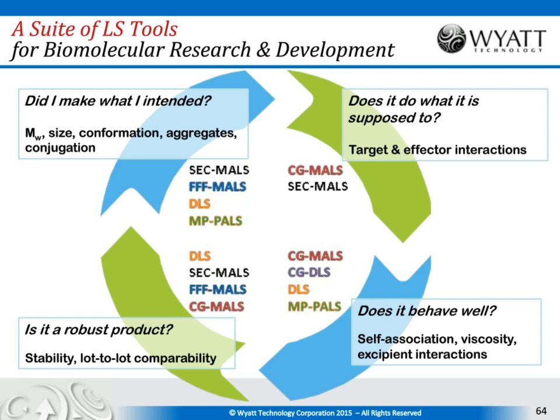Great, thank you. And what is the level of resolution in terms of molar mass difference that the MALS detects? In terms of the MALS measurements, you can see differences on the order of a couple of percent. Now, if you want to actually resolve those species, the question is, can you separate them well enough?